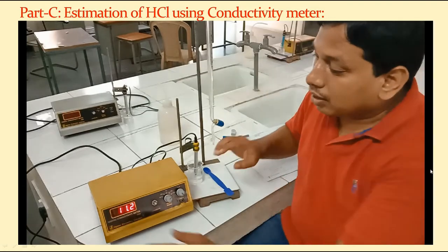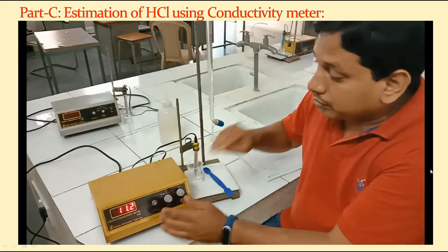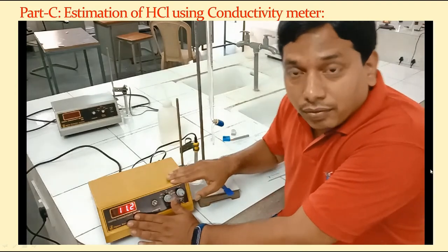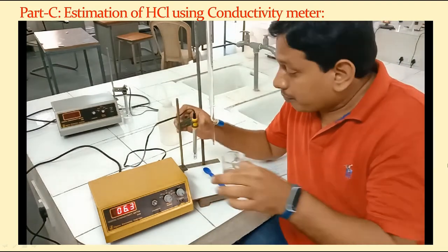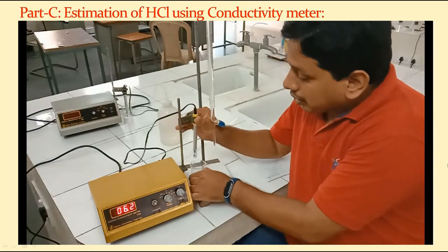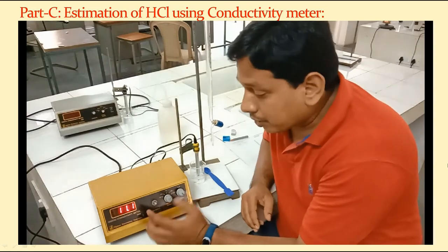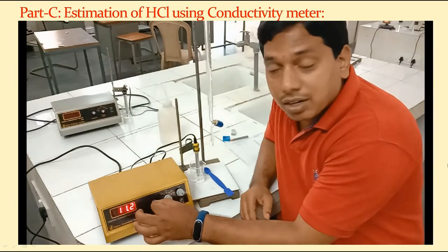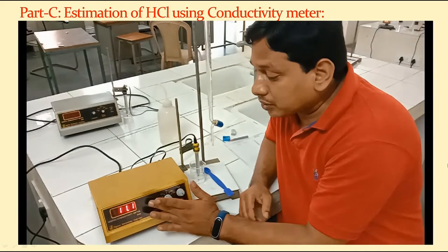Clear? Yeah. This is a digital conductivity meter. Using this conductivity meter, we are going to measure the conductance of the test solution given to you. Before that, here we have three knobs on this instrument. The first one is a calibration knob. We can calibrate the instrument using this button.